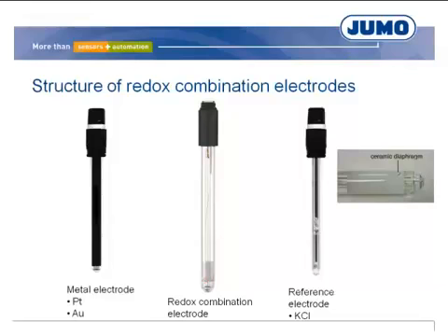As an alternative to the ceramic diaphragm, the PTFE diaphragm creates the reliable connection between the measurement solution and the reference electrolyte in polluted media. Perforated or annular gap diaphragms are used for heavily polluted or adherent media.